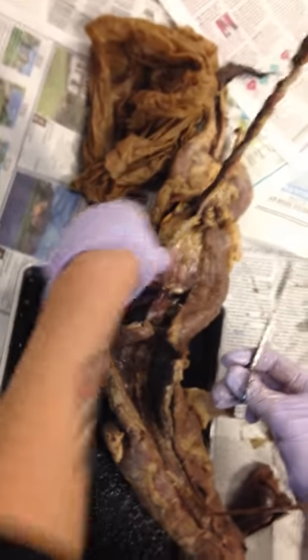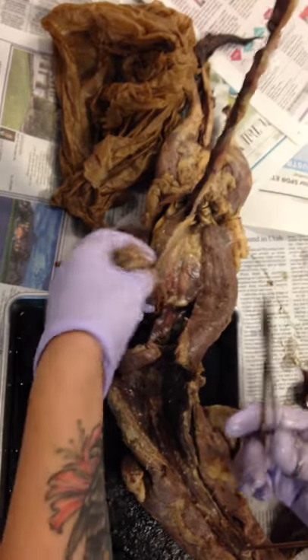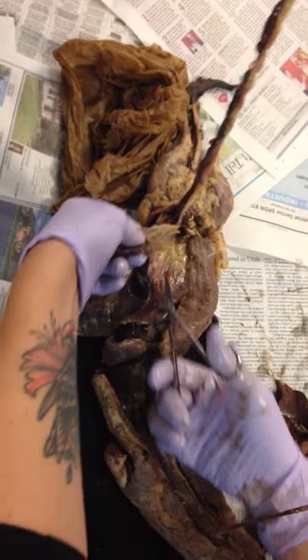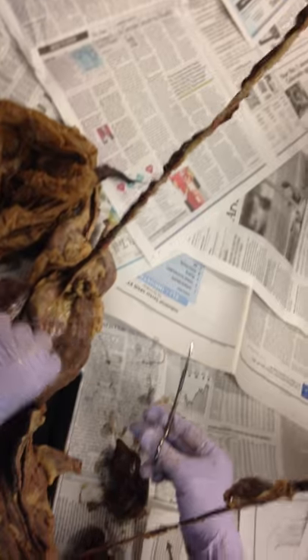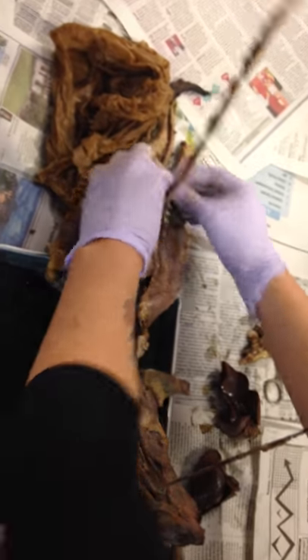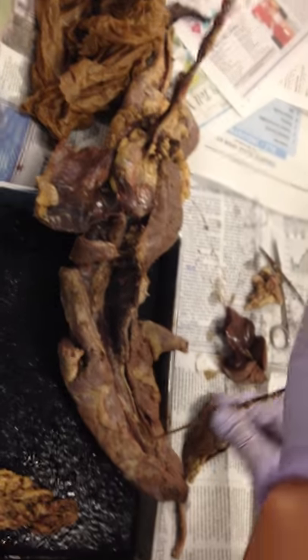If you look on the bottom, this is all the mesentery right down here. Do you see all this mess? Messy mesentery, right? So I'm going to snip through that so that I can see a little bit better. I've got some diaphragm here too. And now I can see pretty much my whole digestive system.